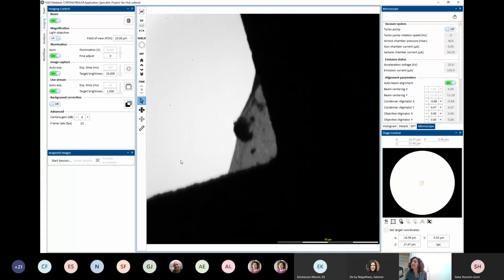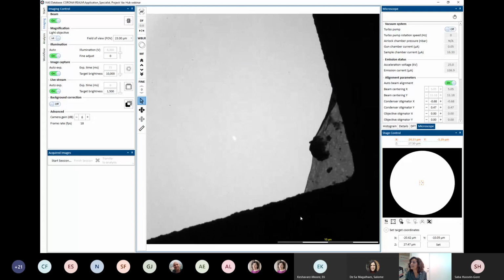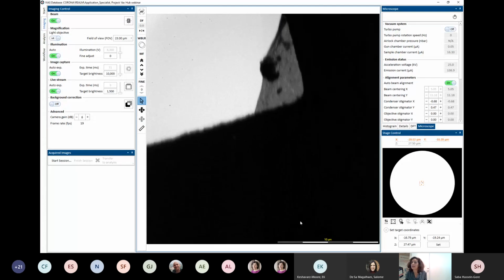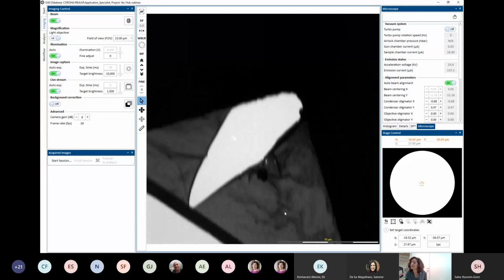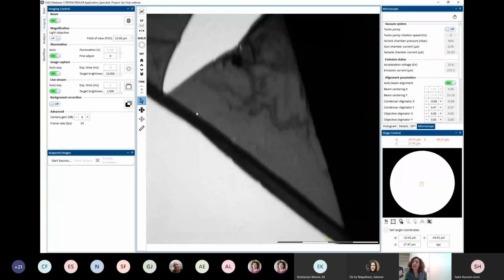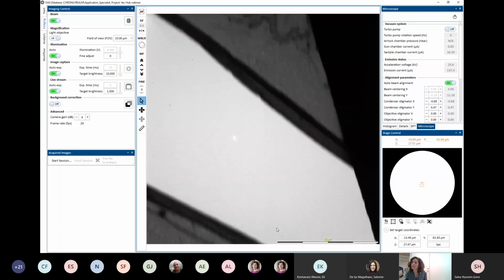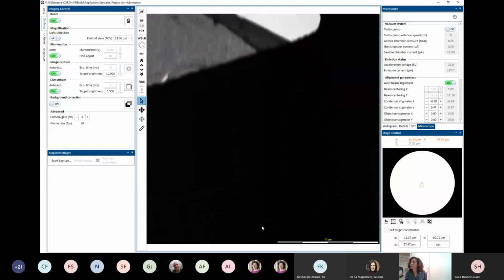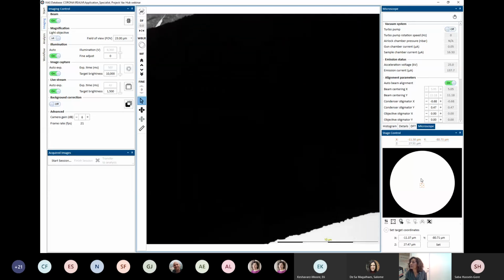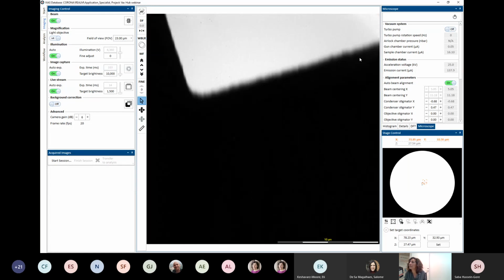This is looking even less beautiful than the last one, right? I'm going to continue here and see if I can find an intact grid. And sometimes you have this. Sometimes you can find this more on the edge, maybe where you have held it with your tweezers. But it shouldn't make you feel like, oh, this is now impossible. I'm going to go here. Now I'm clicking here, just going to move away. Maybe this bit in the middle is a bit ripped.